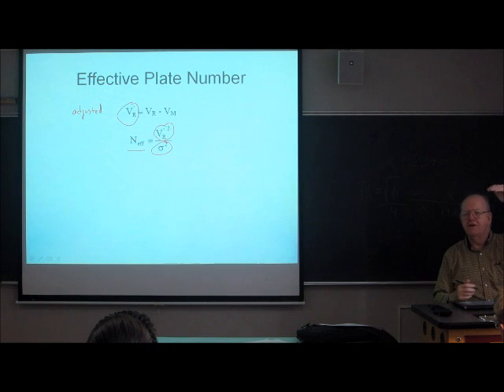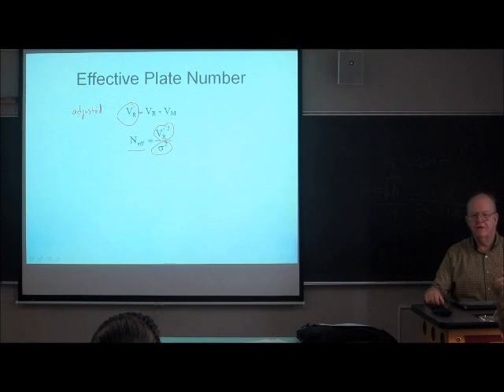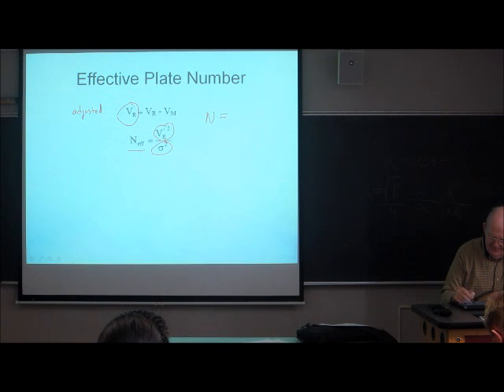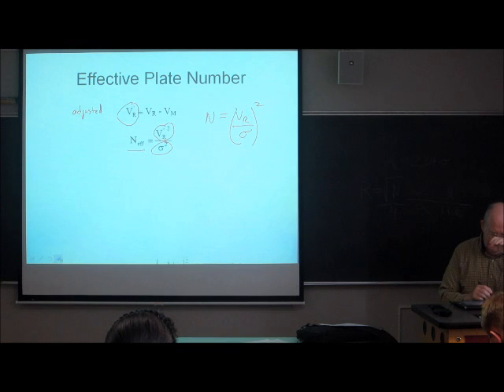Obviously, since you're making the numerator smaller by using the adjusted retention, the effective plate count is reduced. So what these people are really saying is that using the straight definition of N produces an overly optimistic value of the plate count, and they advise against doing that.